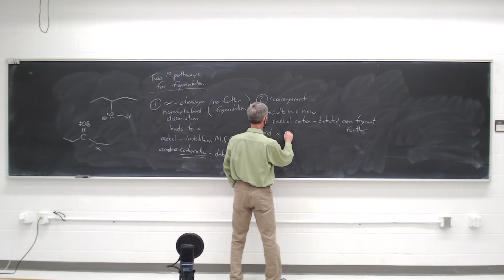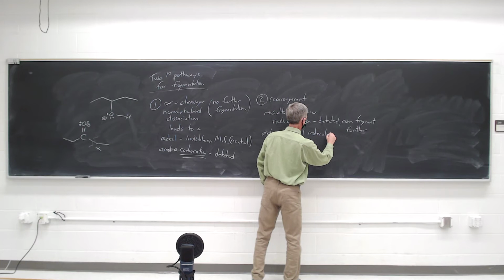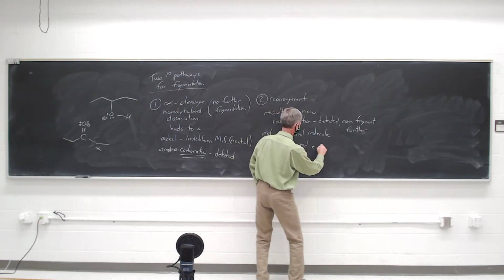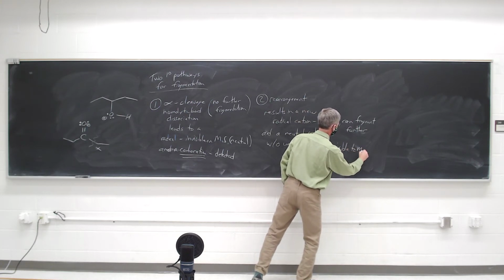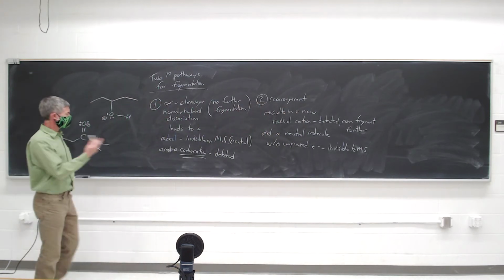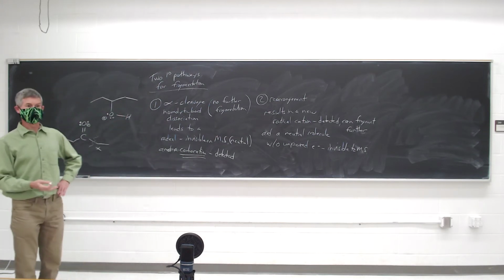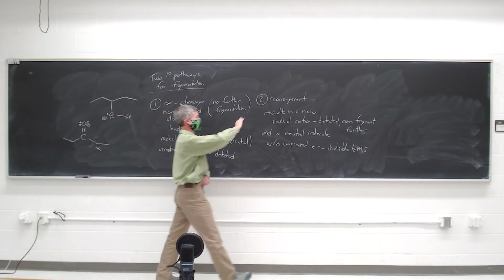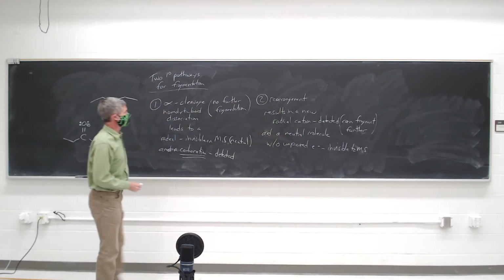And a neutral molecule without unpaired electrons, which is invisible to mass spec. So both of these generate one particle that's invisible on the mass spec because it's neutral, and one particle that you can see because it's still a carbocation. One of them is a terminal pathway. The other one has the ability to create additional fragments from the fragments.